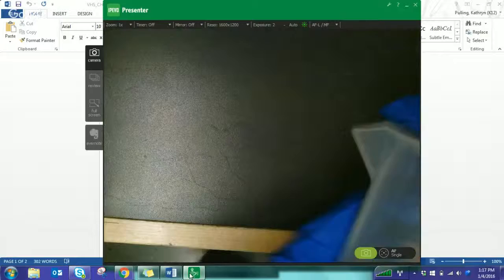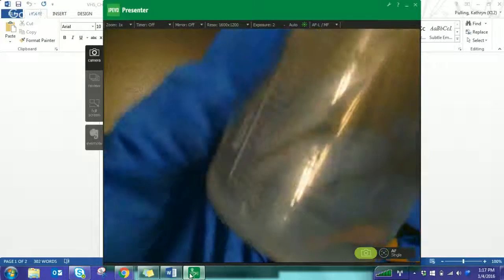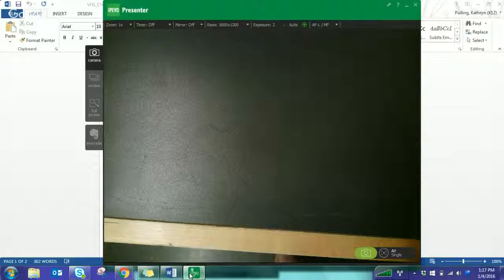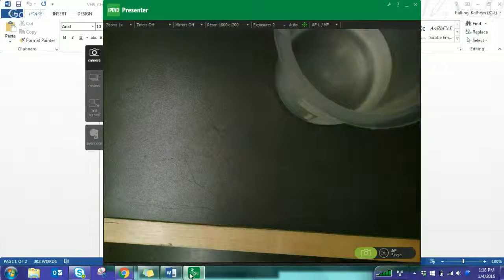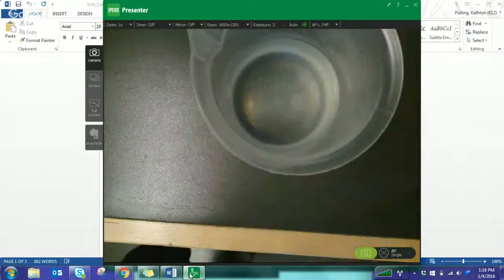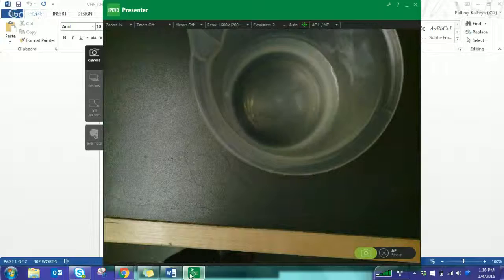So first things first, we need a 125 milliliter beaker of water. Tap water is fine on this one. Just get as close to 125 as you can. It's not actually quite marked on there, so if you end up being a little bit off because you have to go in between 2 lines, it will be okay. But get close to 125 milliliters. If we have a little bit extra, that's fine, because we need the water to dissolve the solids.